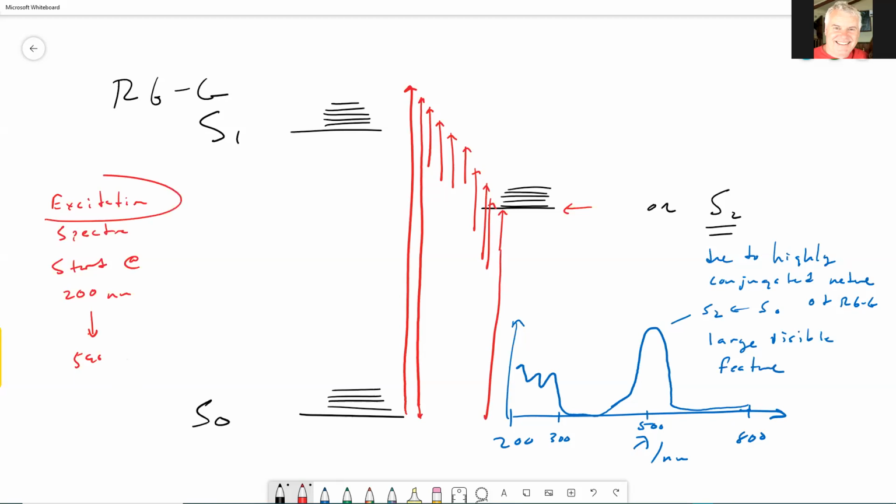And in an excitation spectrum, we're going to take ultraviolet and some visible light here. Oops, I got a highlighter here. We're going to take some light from what's called an excitation monochromator. And then that light, we can set the wavelength, right?